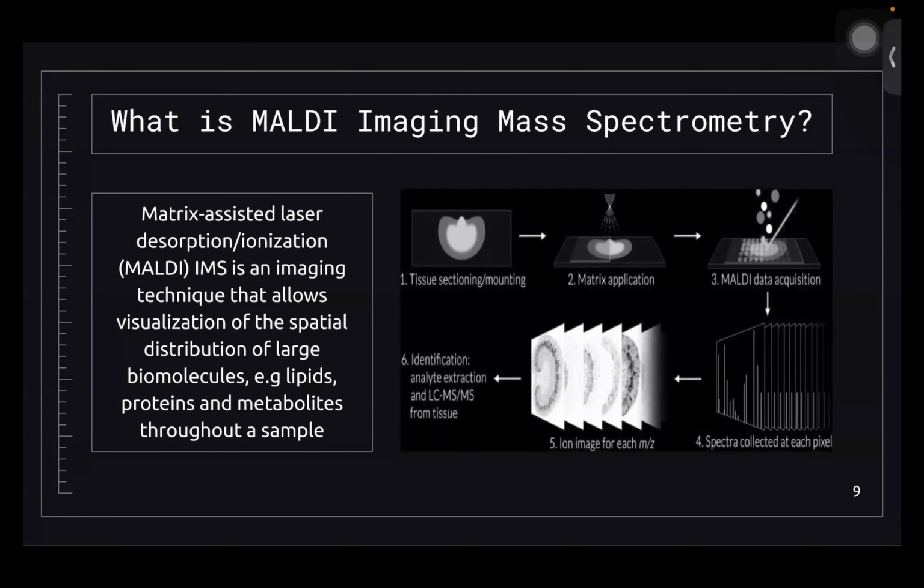So like, where are they located? What's their concentration in that part? So it visualizes the spatial distribution of those molecules. So how it works is you get a tissue section.